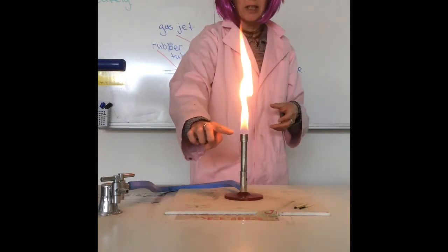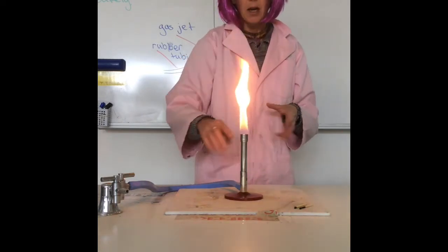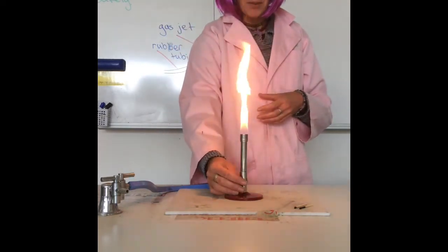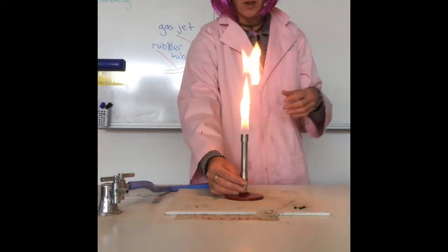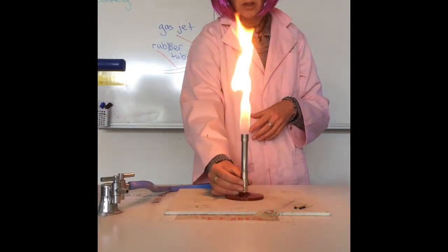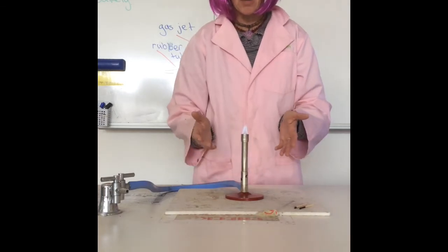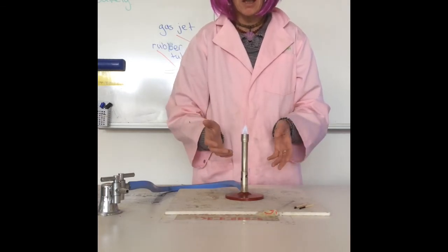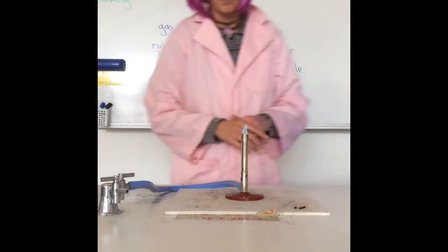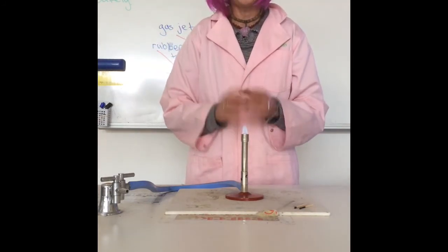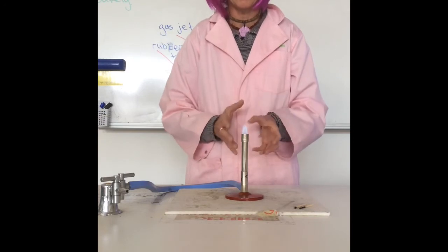It's really easy to see. Now, down the bottom you can actually see a little bit of blue. That's the hotter part. When I go to turn it onto the blue flame, don't do it too slow, but don't open it straight up really quickly. Otherwise, the flame might go out. So we're just going to change the Bunsen burner onto the blue flame. You can probably see it's a lot harder to see. I now have it on the blue flame. We use the blue flame for heating substances in the lab.